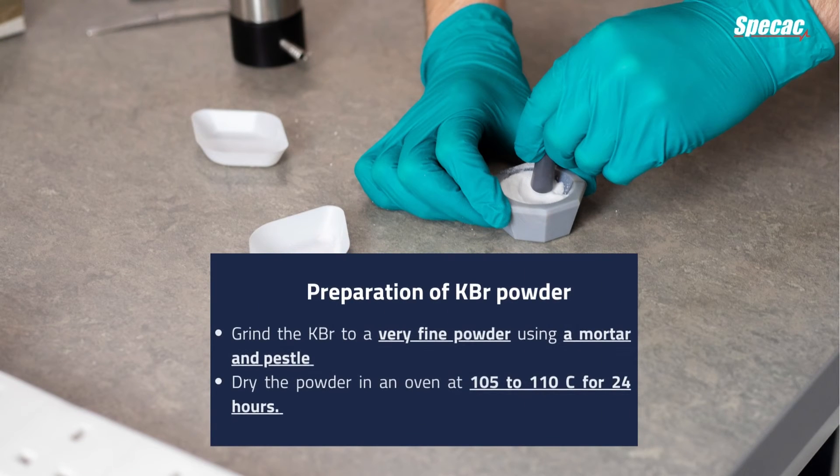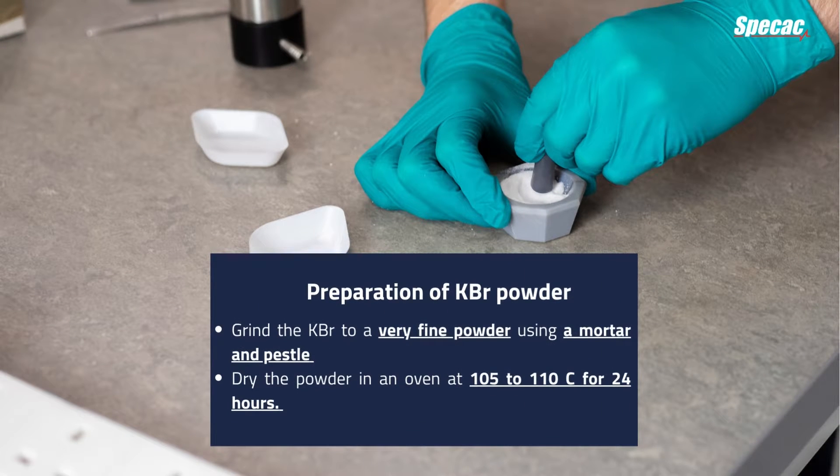Preparation of KBR powder. Grind the KBR to a very fine powder using a mortar and pestle. Dry the powder in an oven at 105 to 110°C for 24 hours.